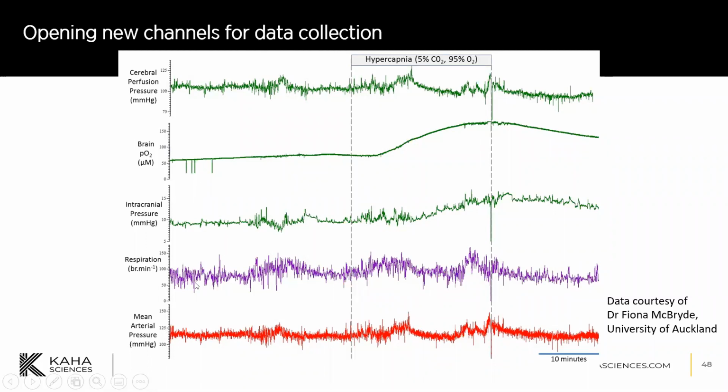And Fiona also has an algorithm in her data acquisition system that allows her to pick up the respiration rate from the waveform of the blood pressure signal, and so she's been able to plot that here as well.